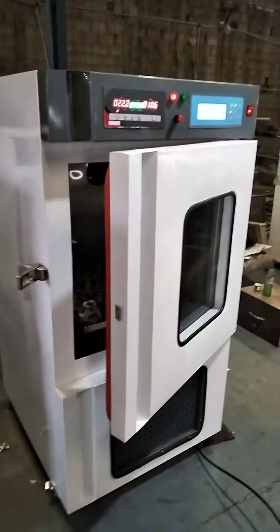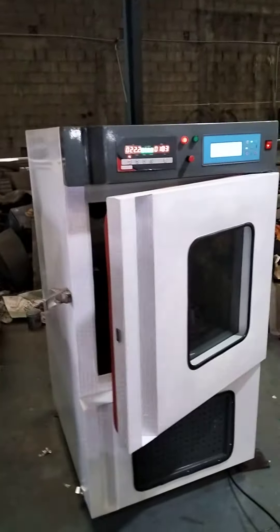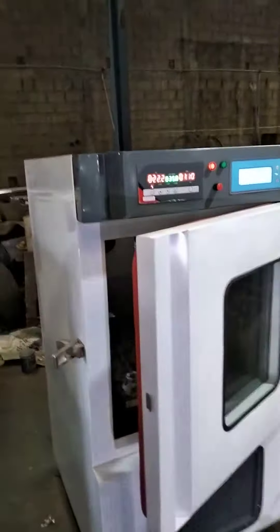Hello friends, my name is Swananda. This equipment is the Incubation Shaker, made by Turbotix Instruments. You can see the design here — this is our product.